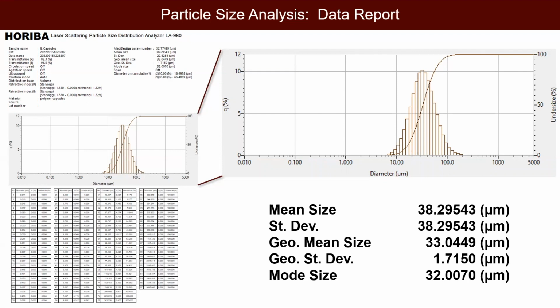Today, I completed particle size analysis on microcapsules of ionic liquid. The sample was produced through an emulsion-based template, which is known to have little control over particle size. Thus, a relatively broad distribution and high standard deviation, as shown, is expected for this sample. However, if the user were to measure, for example, monodispersed nanoparticles with a standard size, a much narrower size distribution would be observed.